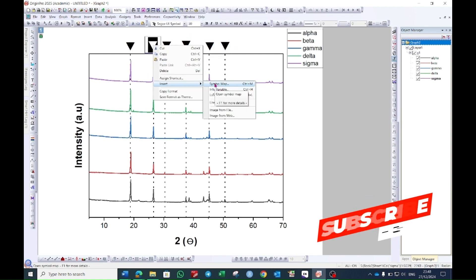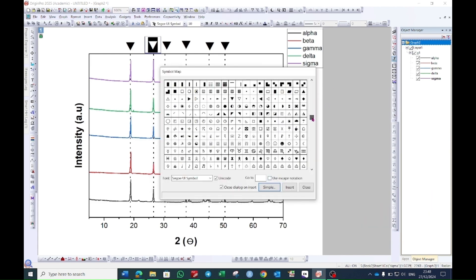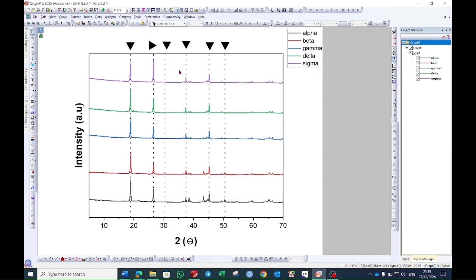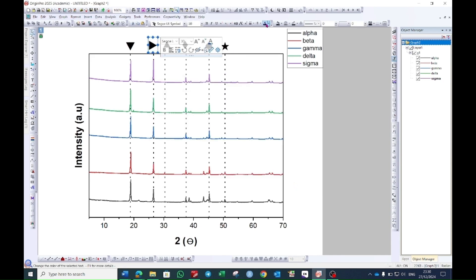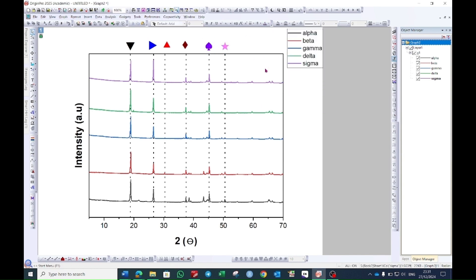Now select the sample, press Ctrl+C and Ctrl+V, and bring this sample to the top of each peak. Double-click on this symbol, select Symbol Map, and go to the Advanced option again. Choose another symbol, press Insert — this symbol is chosen. I will do the same for the rest of the samples. Now select the symbol; you see here 'Font Color' — select this and choose whatever colors you want to give to your samples.